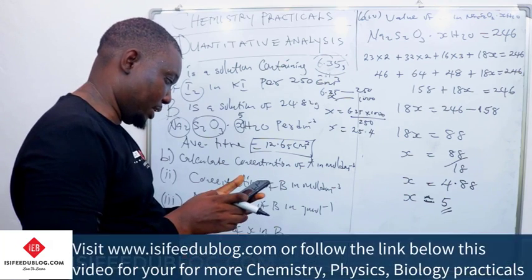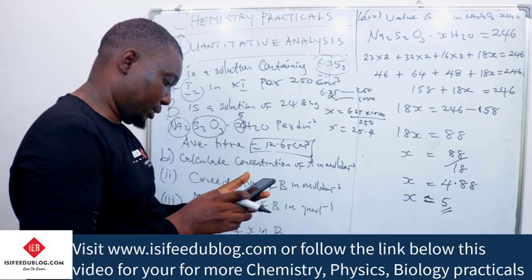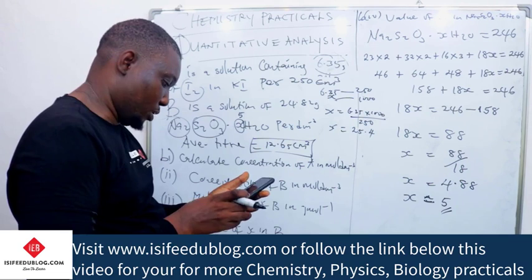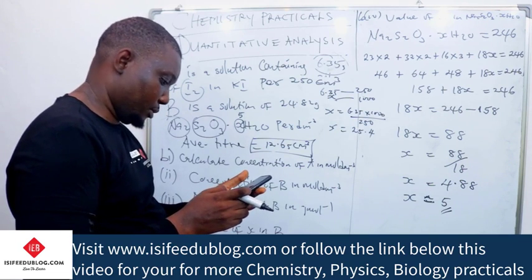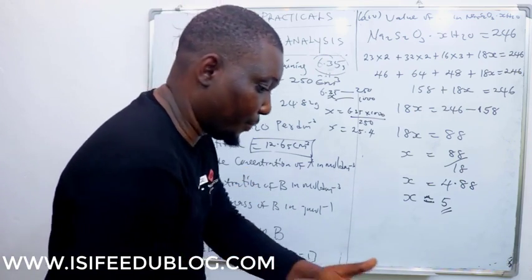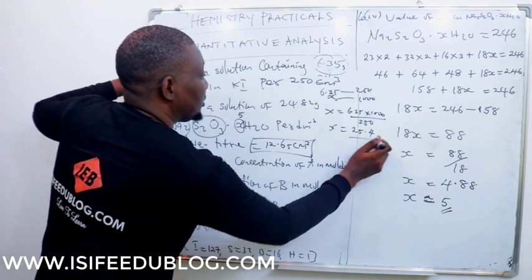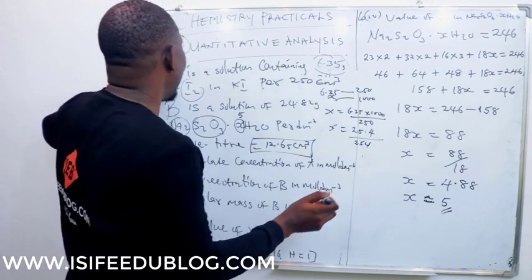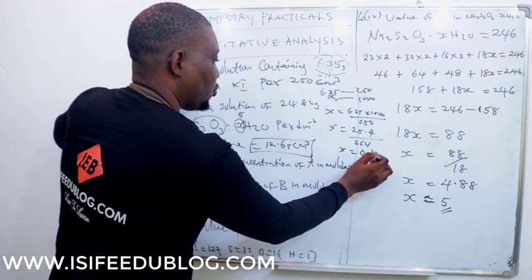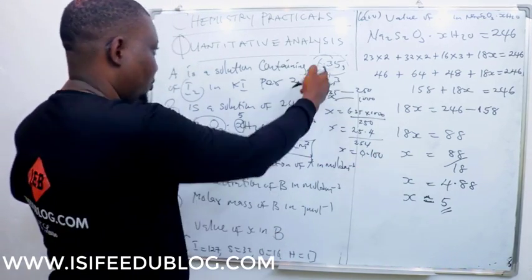So this is going to multiply by 1000. Let's see. 6.35 times 1000 divided by 250. Oh, correct, 25.4. So this is our mass concentration. If you want to go to molar concentration, that will be this over 254, which is the molar mass of I2. That will give me 0.100 mole per decimeter cube. So that is how to do this, supposing the question goes this way.